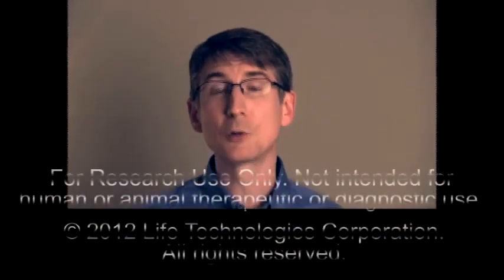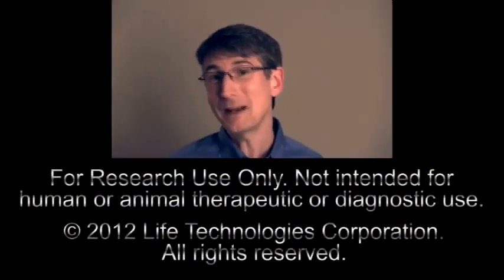And that's all there is to using ExpressionSuite. Just remember to have a look at the embedded help menu I mentioned earlier if you have further questions. You can also give Life Technologies Technical Support Hotline a call or contact your local field applications specialist. LifeTech also offers numerous on-site and in-house training options.